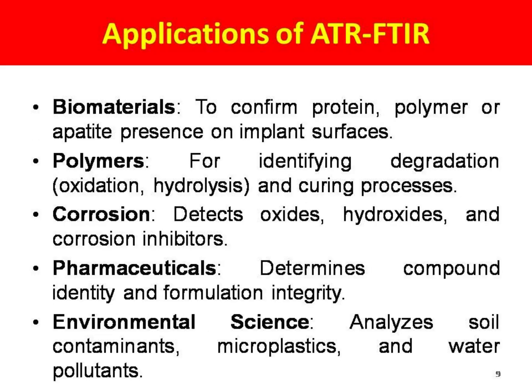The applications of ATR FTIR: in biomaterials, to confirm protein, polymer or apatite presence on the implant surfaces. It is used in the field of polymers to identify degradation, that is oxidation and hydrolysis processes, and curing processes also.